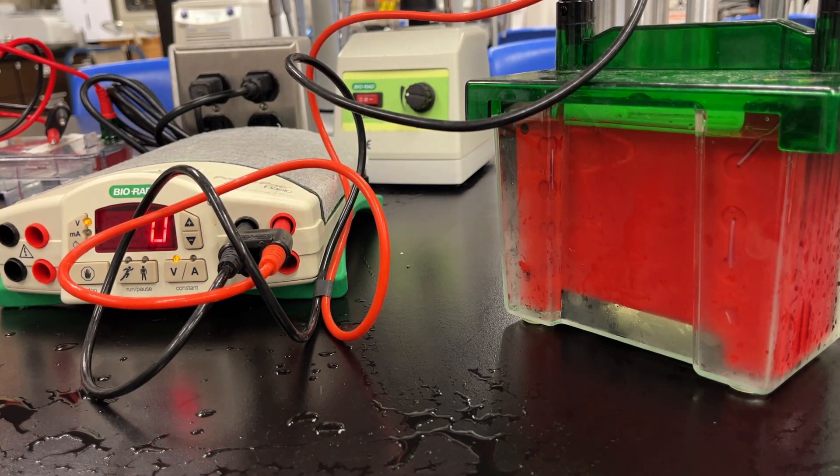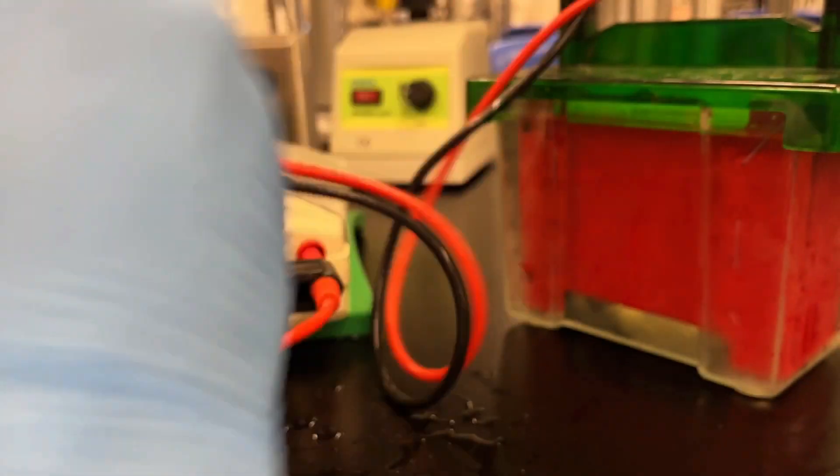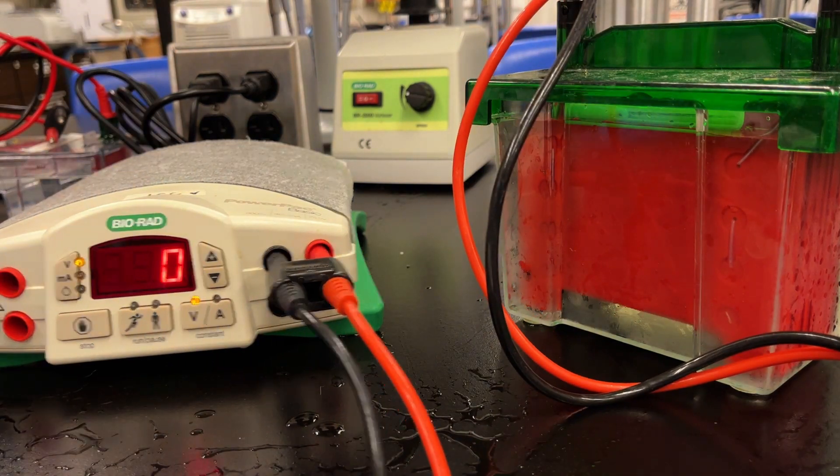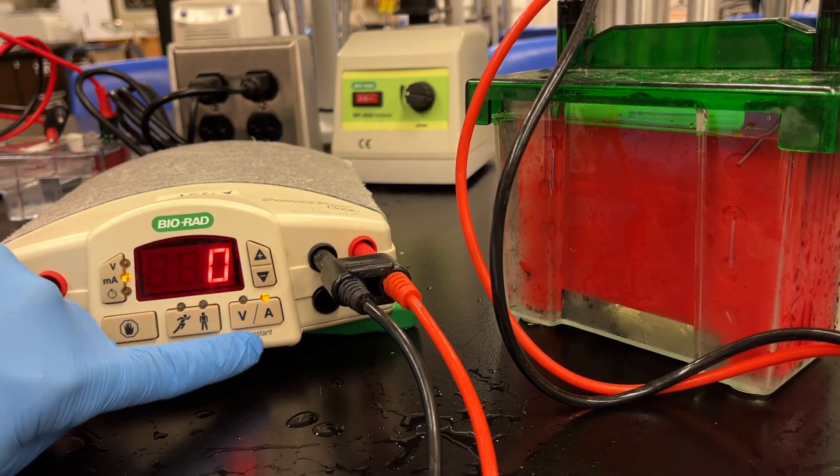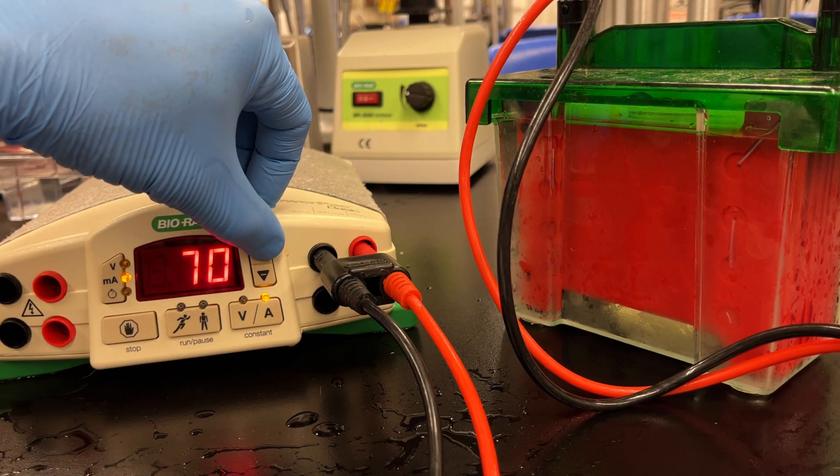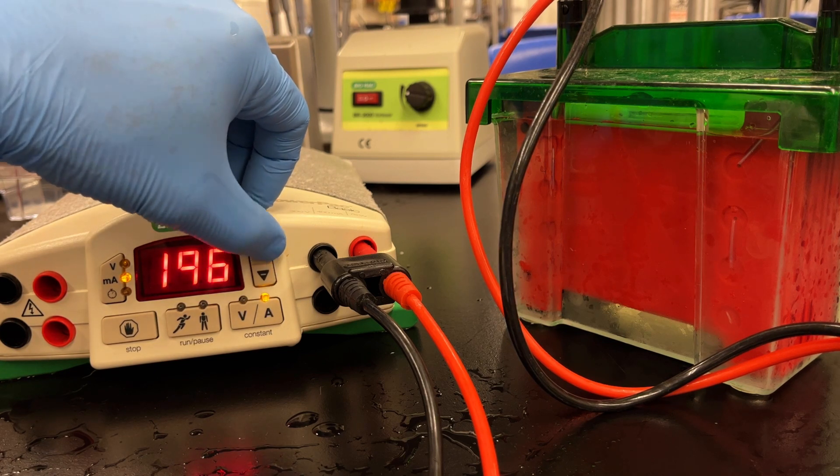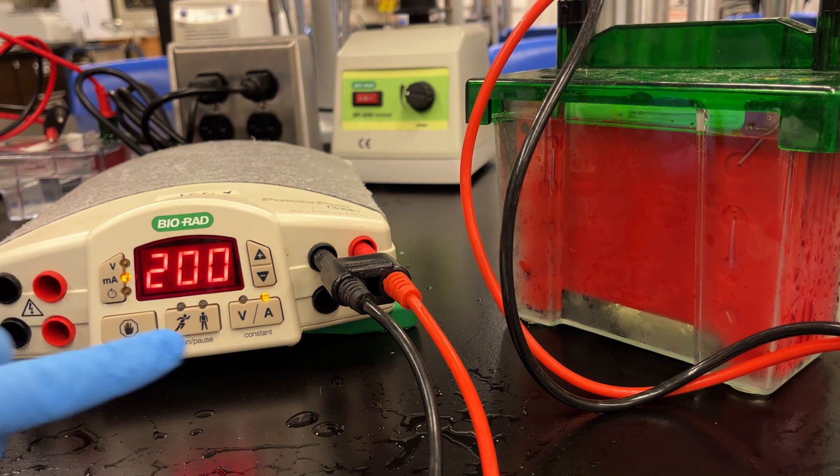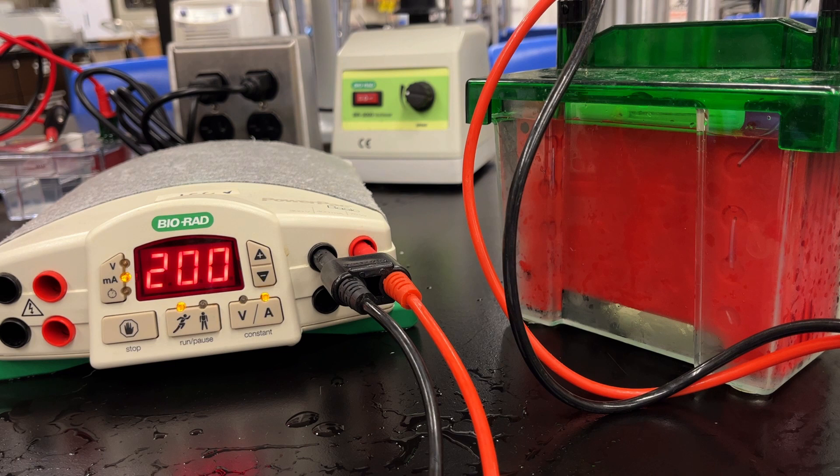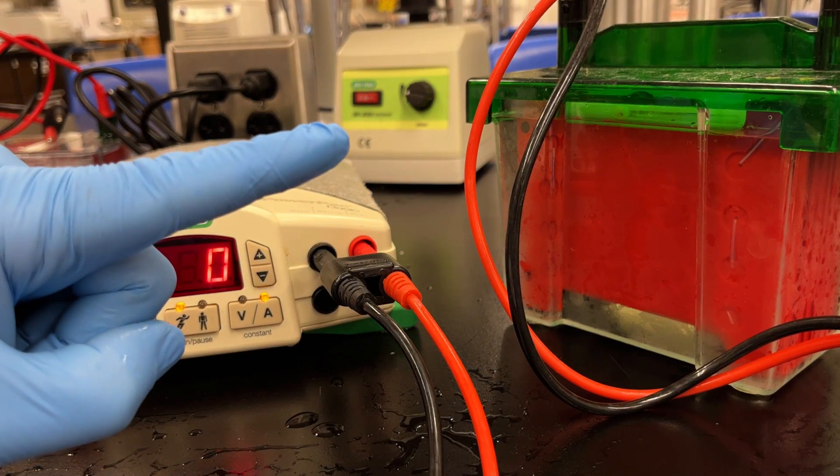And then unlike our transfers in the past, or sorry, our runs in the past where we go with constant volts, make sure that we go constant amp. So once again, get the darn cables out of the way. Constant amp. And we're going to run it at 0.2 amps or 200 milliamps. So this power supply reads it in milliamps. So 200 milliamps. And then we transfer for 60 minutes. So constant amps. Make sure it's 200. Hit the running person. And then you can set the timer to 60, but I generally don't just in case I don't make it back in time.